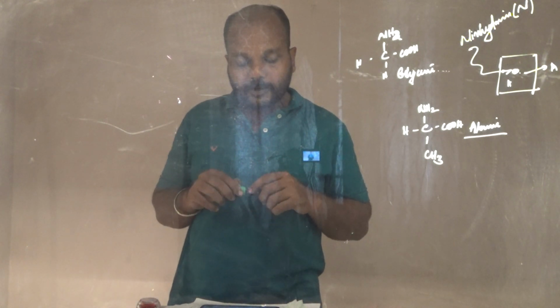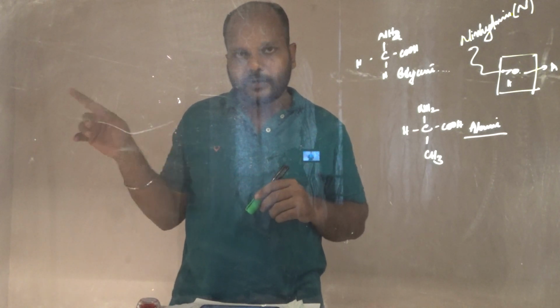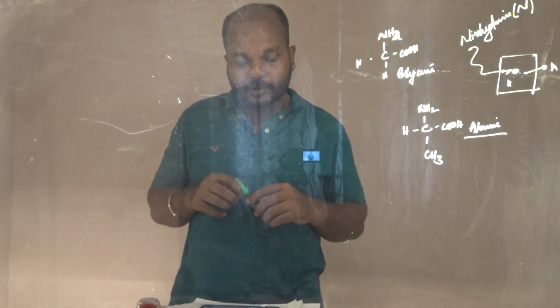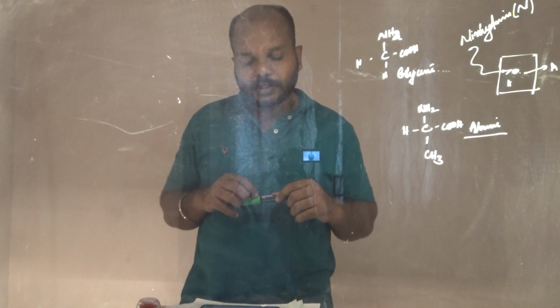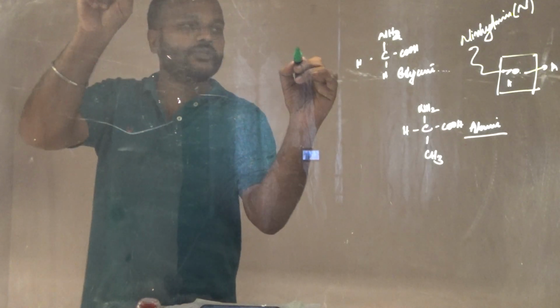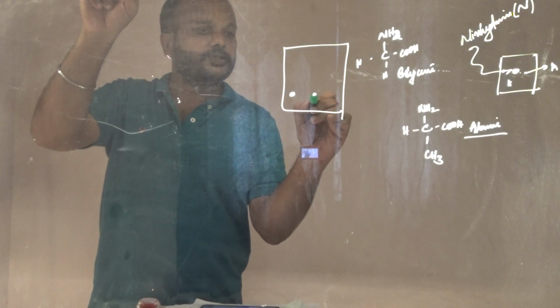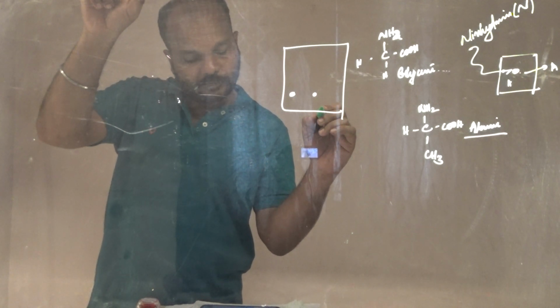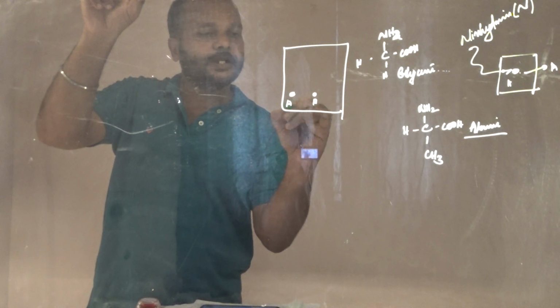Okay. Fourth question: for the chromatogram above, the one we were showing previously, are any of the amino acids in B to E also present in A? How can you tell that? Suppose you consider this chromatography paper. This is A, right? Suppose this is B. This A contains 2 amino acids.